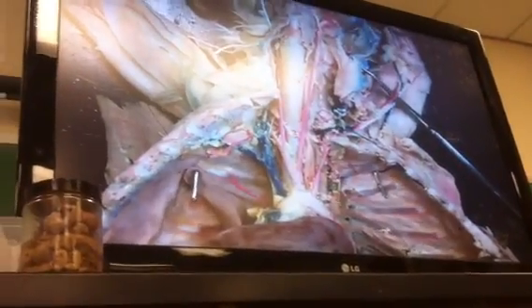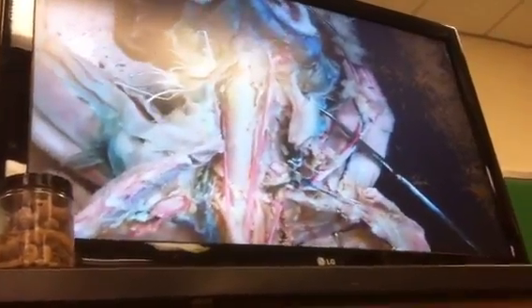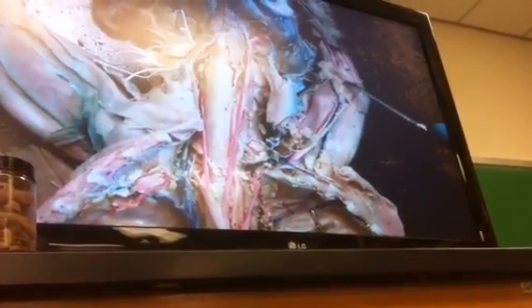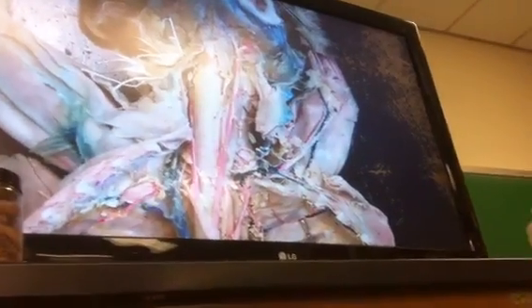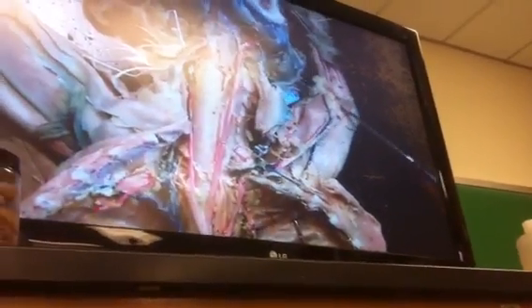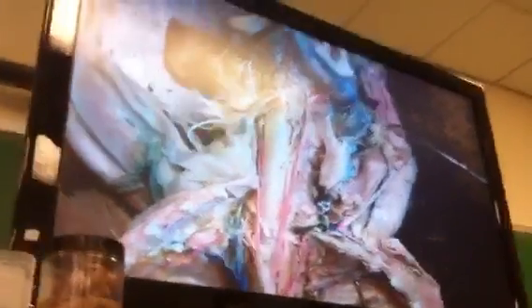I'm changing my name to brachial because I am now in the arm. Once I do that, there's a bone I'm going to go through — there's a foramen in the bone. That opening is called the supracondylar foramen. When I come out on the opposite side, if I tag it right there, this fellow is called radial. Any time I tag it before the split, it's going to be called radial.